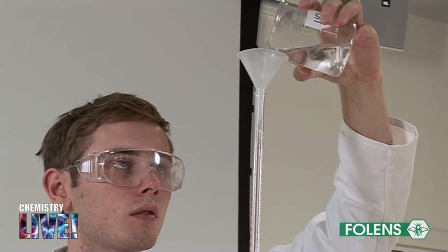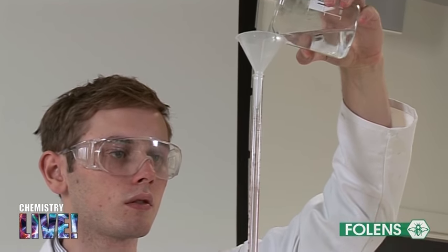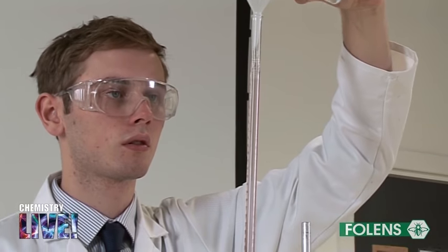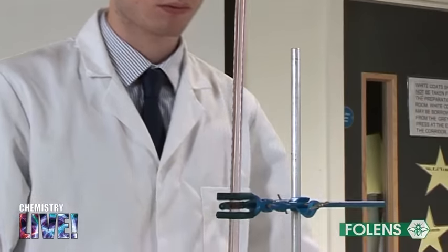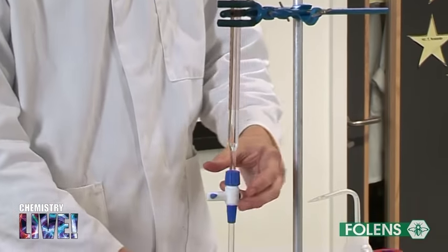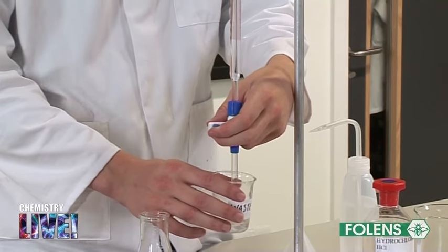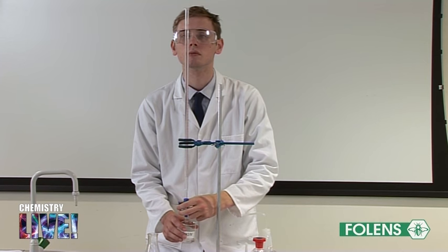Although it is not essential to have the burette reading at the zero mark for each titration, it is less likely to cause errors for the student if the meniscus is brought back to the zero mark. This means that the volume may be read directly and that there is less likelihood of an error when subtracting the initial reading from the final reading. The conical flask should be emptied and rinsed out well with deionized water before each titration is carried out also.